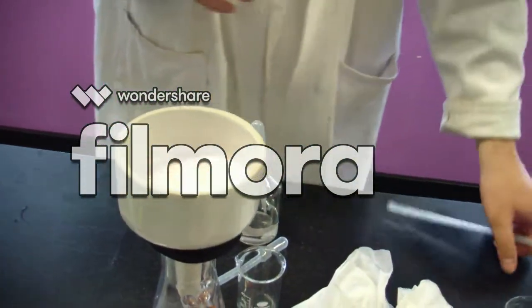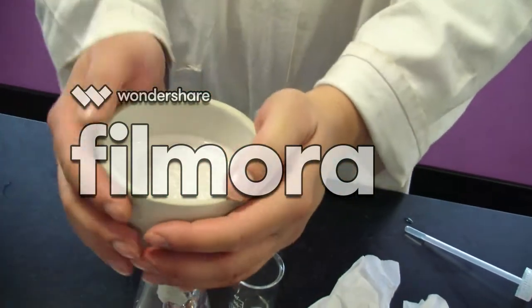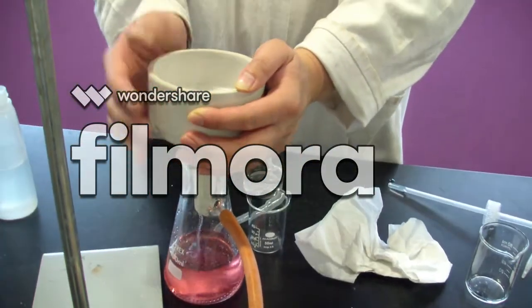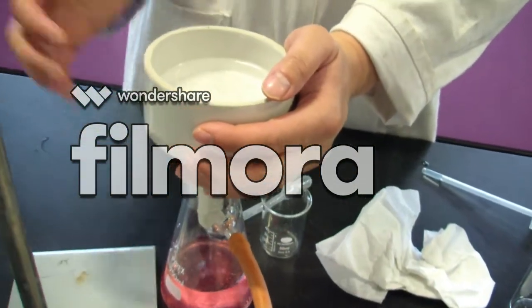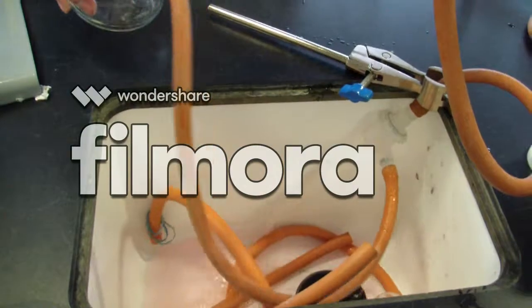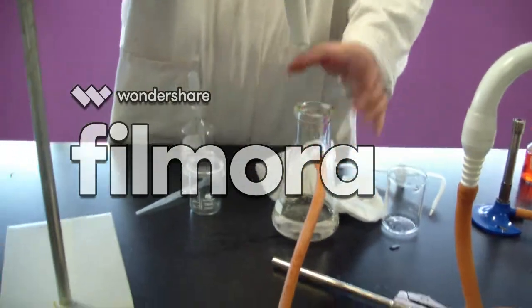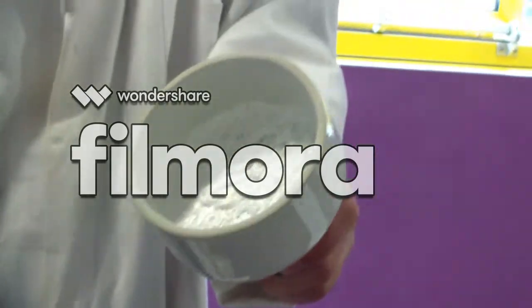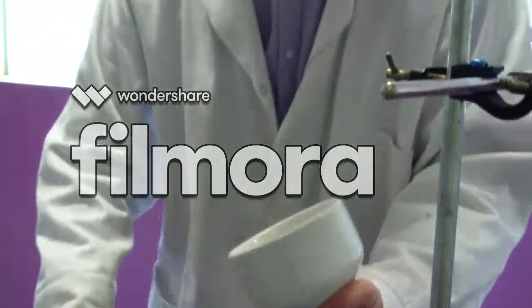We clean it in order to remove the pink solution that's still locked into the solid. We do this 2 or 3 times, and as you can see, the pink solution is slowly disappearing. Making sure that if it's full, we empty it into the sink. And now we do it one more time. As you can see, the pink solution has now disappeared, and all we've got left is the impure benzoic acid. So here's a beaker, and I can show you what it looks like.